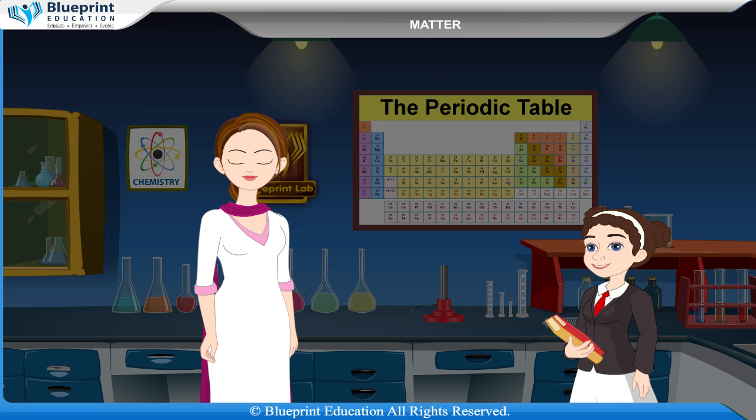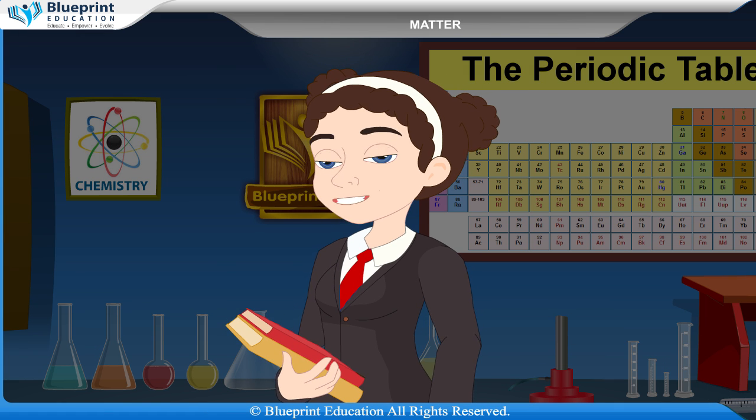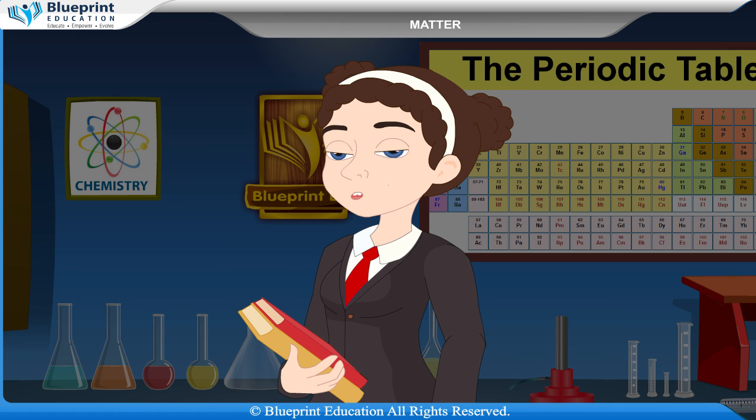Sodium hydroxide is a base. It neutralizes hydrochloric acid solution to produce sodium chloride, common salt, and water. Aqueous HCl plus aqueous NaOH gives aqueous NaCl plus liquid H2O. Ma'am, how can we study the difference in the properties of HCl and NaOH?